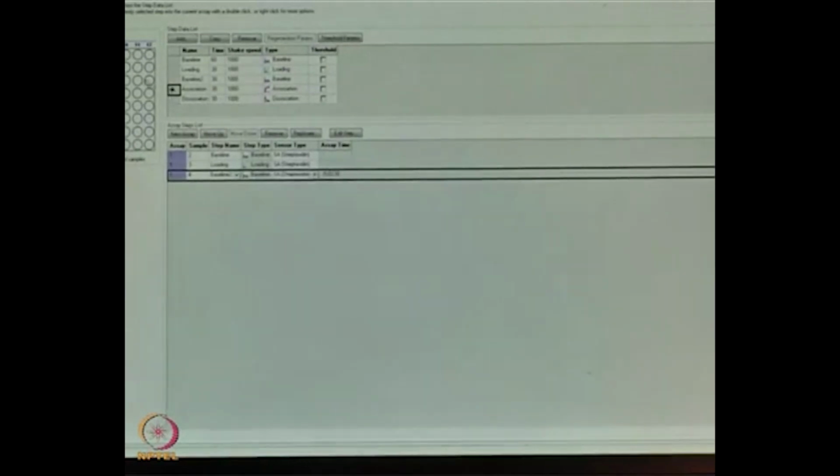The next step is the association step. This is the sample, the mouse monoclonal antibodies, two-fold diluted, 6 data points. Then for the dissociation step I use the same buffer, that is column 4. These are the sensors we are using; I am using a streptavidin sensor.